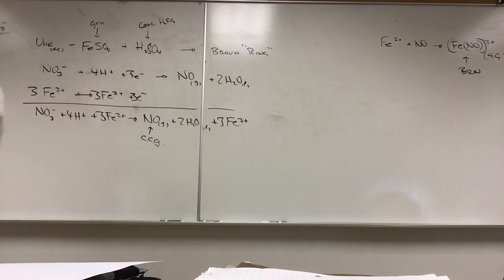In fact, did I tell you one of my students got a 3rd-degree burn? Yeah. This is how she got it. She dumped in the concentrated sulfuric acid all at once.